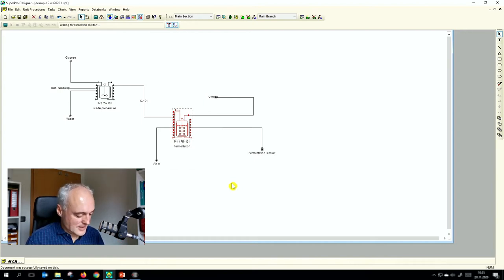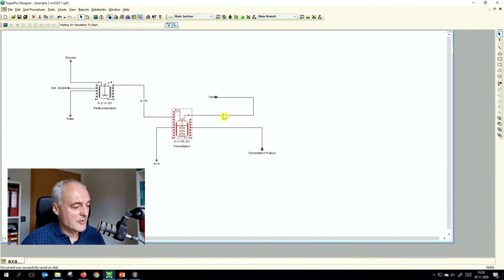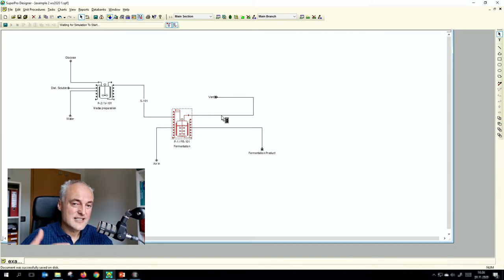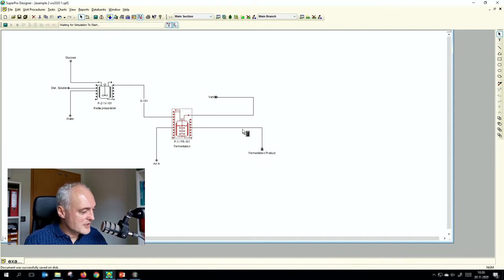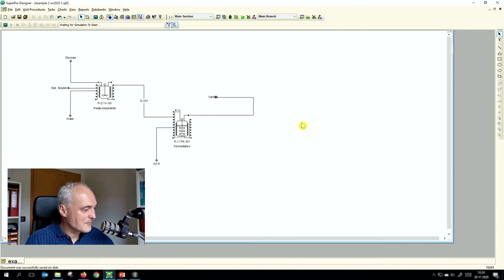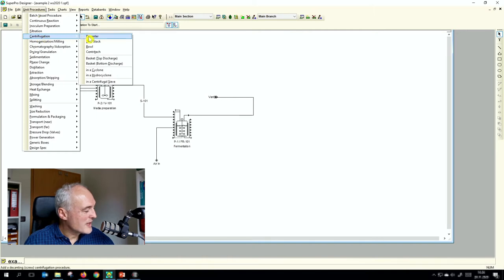We want to add a downstream process: a centrifuge. You don't sell your yeast right out of the fermenter — you centrifuge it and enrich it. We will use a disk stack centrifuge, which is a continuous centrifuge. So we add a centrifuge here; first we delete the existing stream, then go to Unit Procedure, centrifugation, and select disk stack centrifuge.